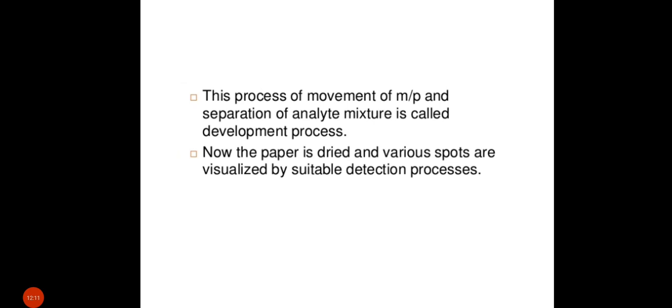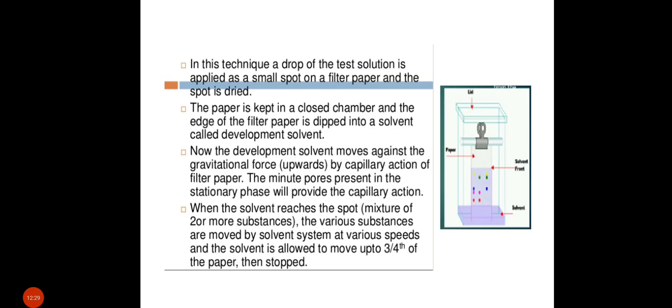Now the paper is dried and various spots are visualized by a suitable detection process. So in this way, paper chromatography works. So this is the principle of paper chromatography.